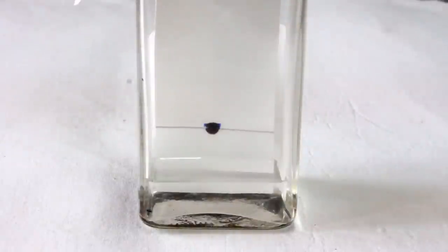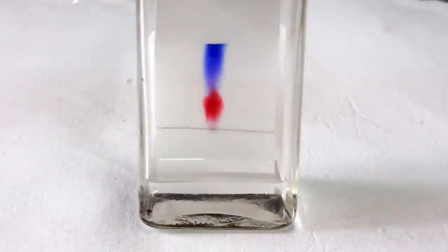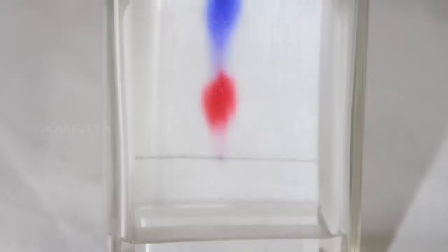Keep the chamber undisturbed for some time. Notice the rise in solvent along with the mixture of red and blue inks. When the solvent has risen, you will notice two different spots of blue and red colors on the filter paper.